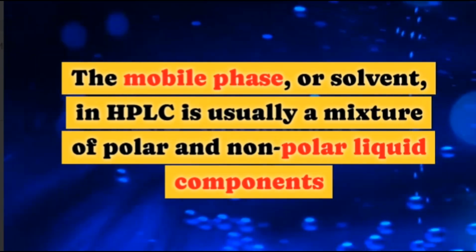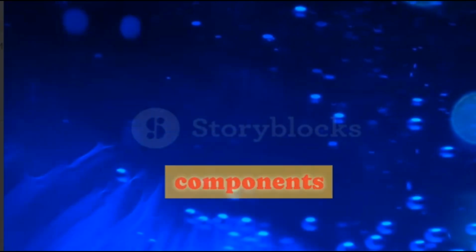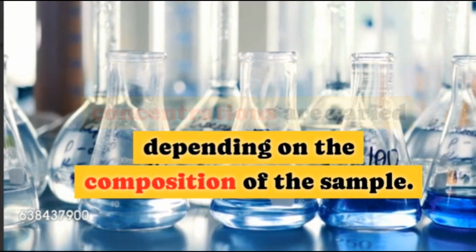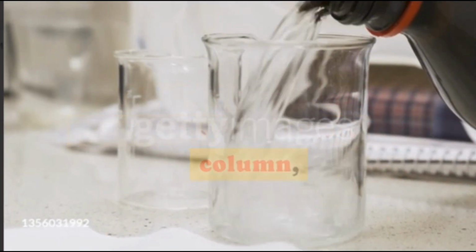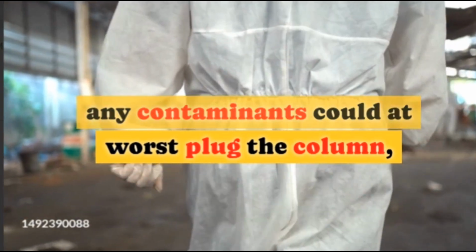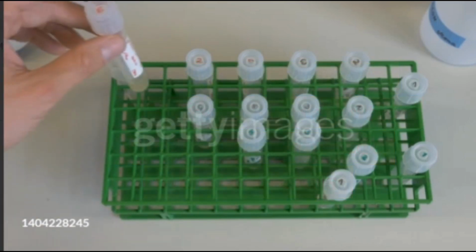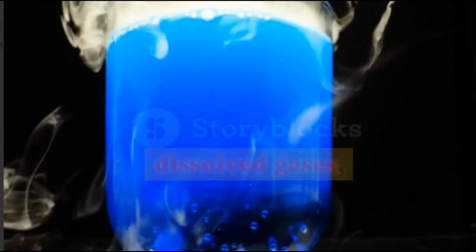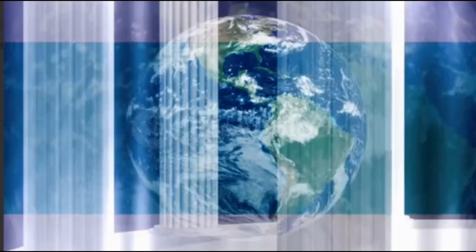Solvent. The mobile phase, or solvent, in HPLC is usually a mixture of polar and non-polar liquid components, whose respective concentrations are varied depending on the composition of the sample. As the solvent is passed through a very narrow bore column, any contaminants could at worst plug the column, or at the very least add variability to the retention times during repeated different trials. Therefore, HPLC solvent must be kept free of dissolved gases, which could come out of solution mid-separation, and particulates.